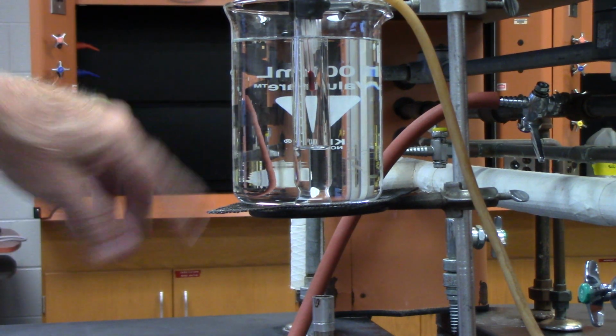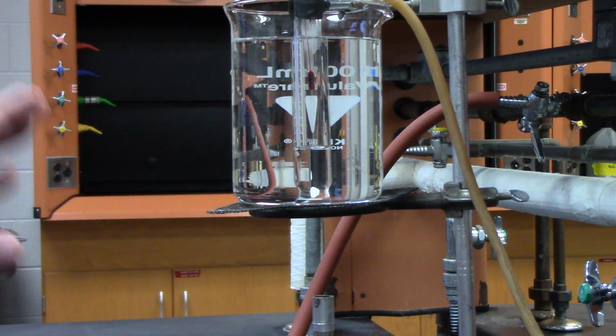It doesn't matter if it's bubbling. It will be bubbling, but that bubbling doesn't determine when it boils. It's when the temperature stops going up.